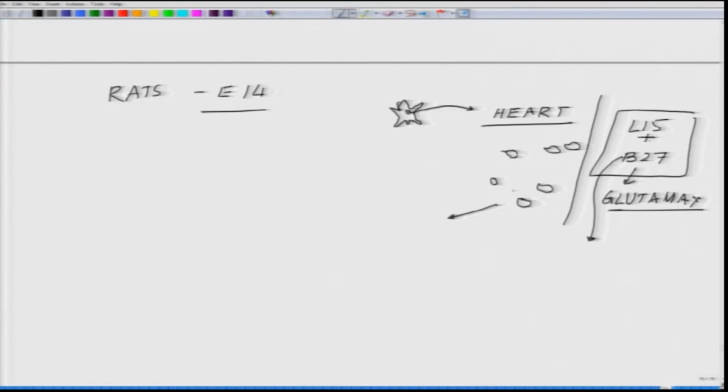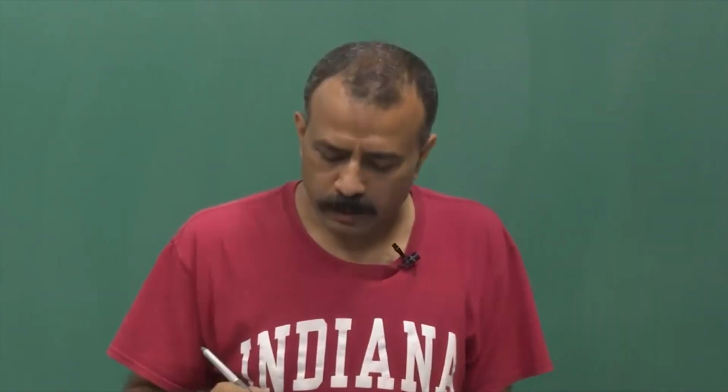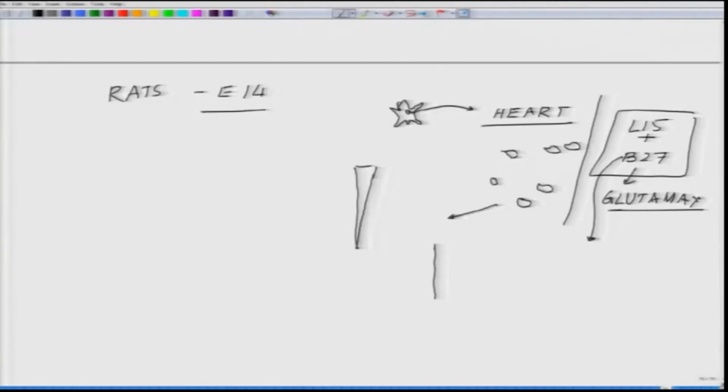Then you have to dissociate. You have the complete heart with you, this is a small heart. The easiest way to dissociate will be mechanically. This is, I believe, the easiest way, because these hearts are very fragile, very easy to work with. In a vial, you collect these hearts. Say, for example, you could manage to pull hearts from 10 embryos, here is your medium.